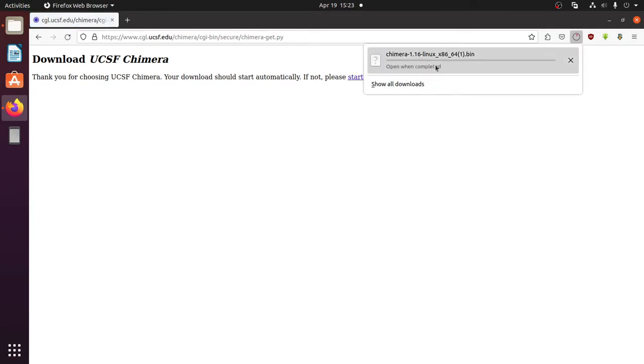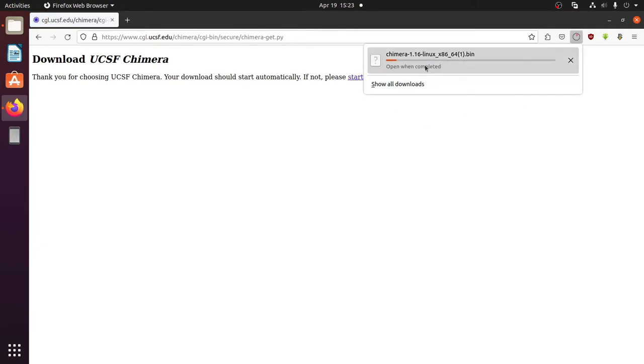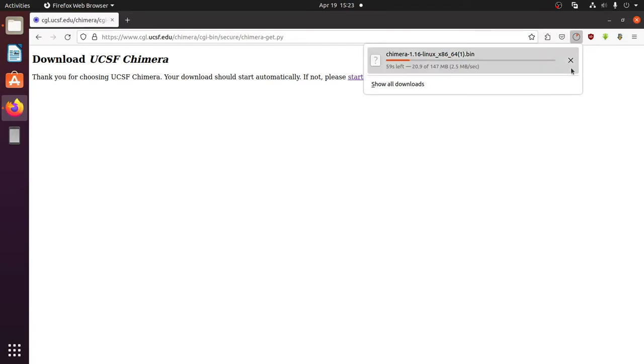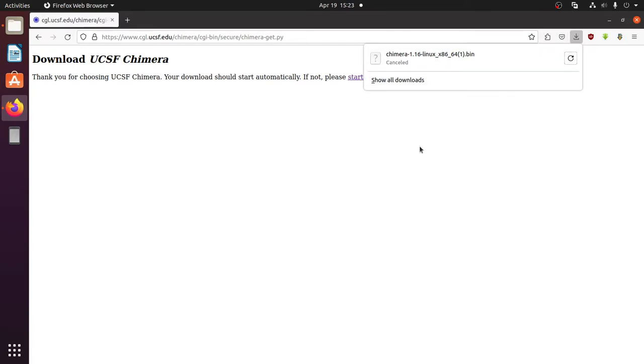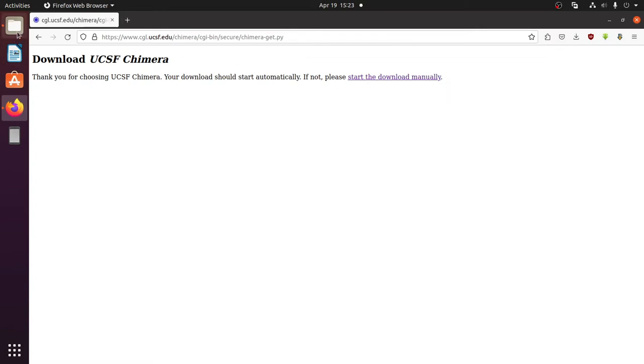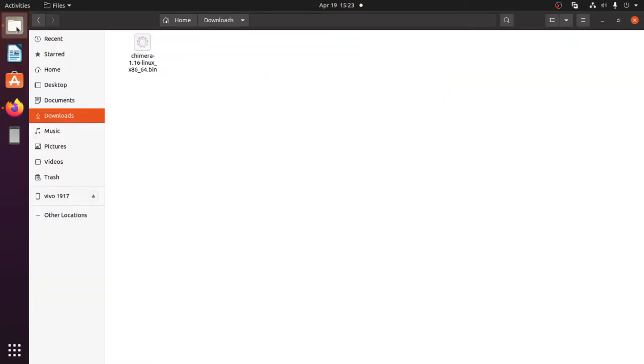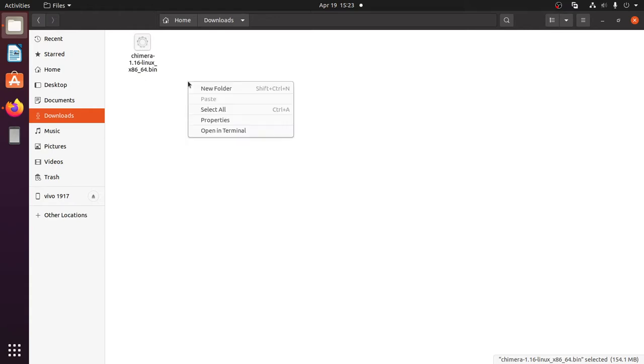It started downloading. Since I have it already, I'll cancel the download. Go to the folder where you downloaded UCSF Chimera, right-click in empty space, and click 'Open in Terminal'.